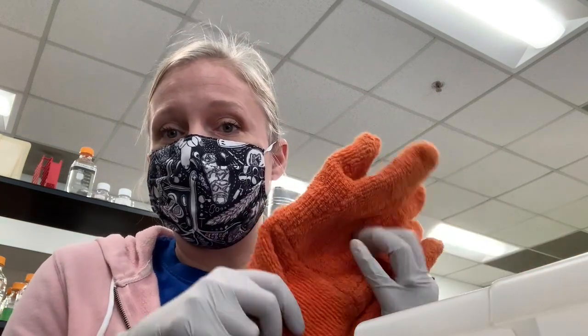There are a couple that are not appropriate, so detergents cannot be autoclaved. They're destroyed by high heat. And there are a few other chemicals in the laboratory that, because of their nature, cannot be autoclaved for sterilization. So if you want to sterilize a chemical by autoclaving, before you take everything to the autoclave, grab a pair of autoclave gloves.